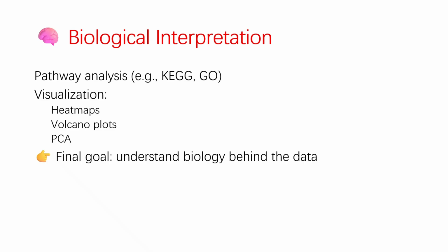In the end, RNA-seq is not just about data, it's about telling a biological story. From raw reads to biological insight, RNA-seq allows us to uncover the hidden mechanisms inside cells, one step at a time.